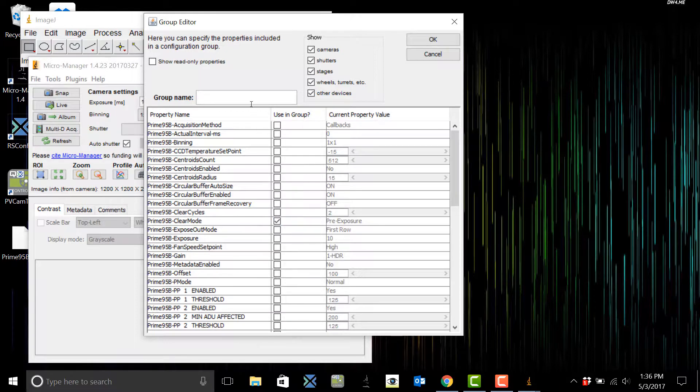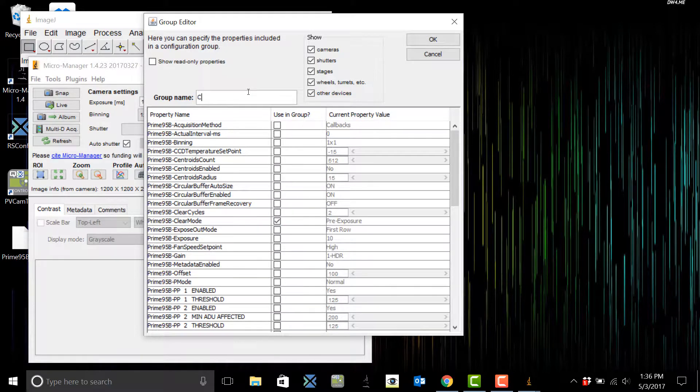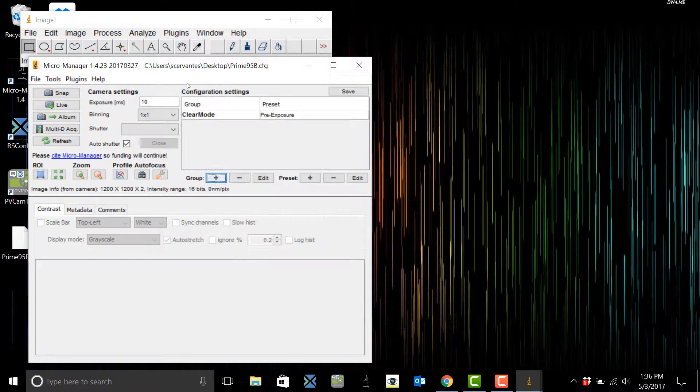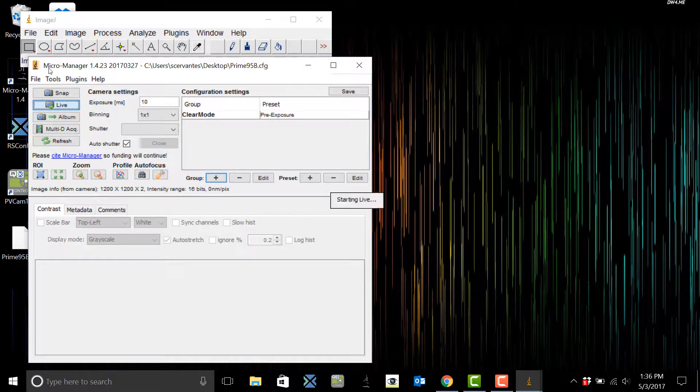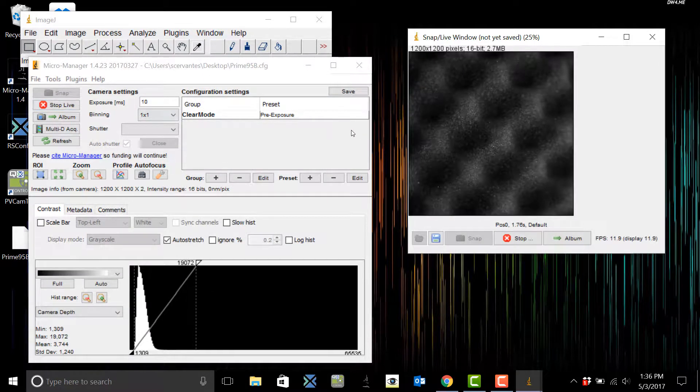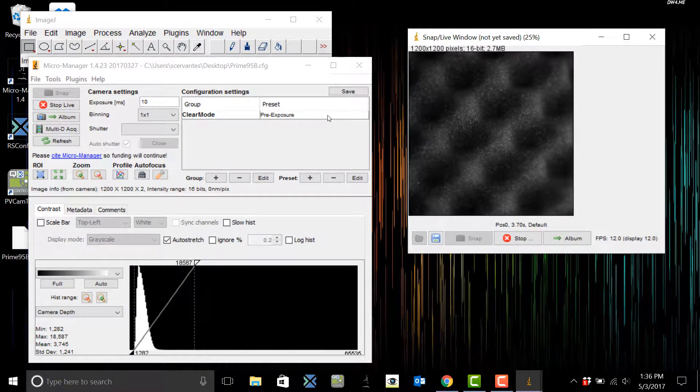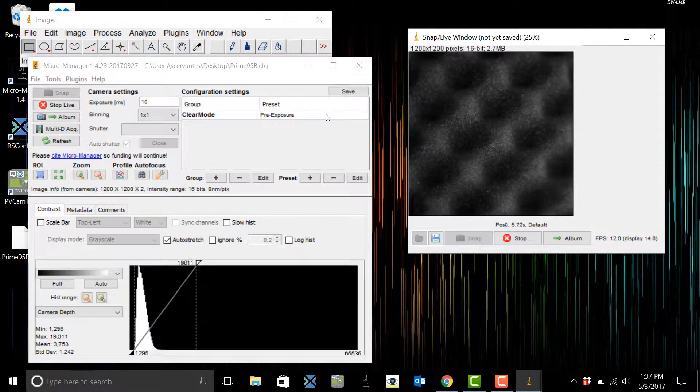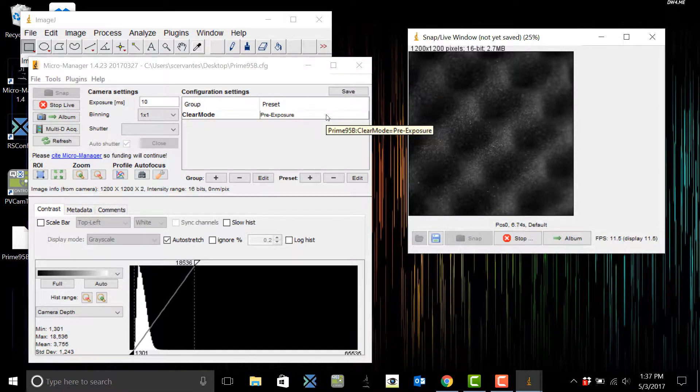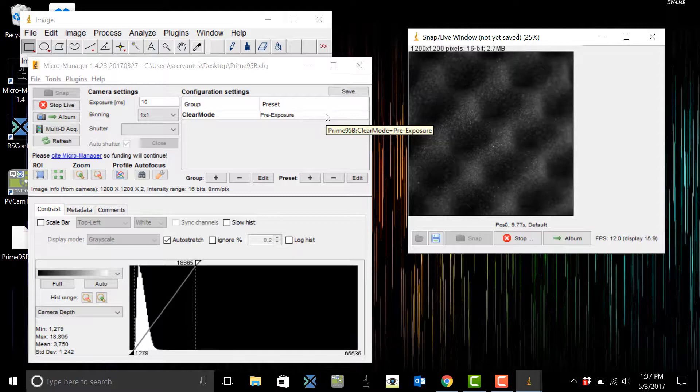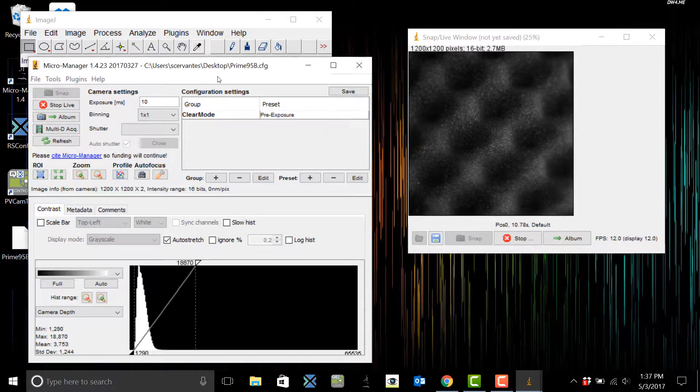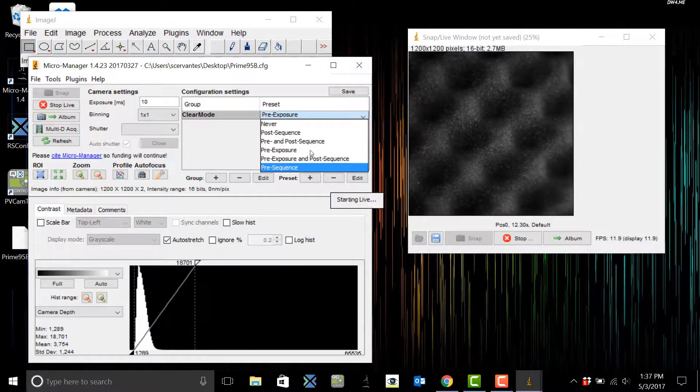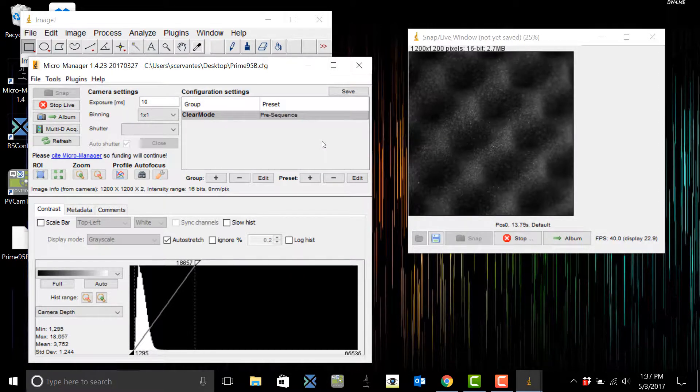Now if we go live, the default starts at pre-exposure and that means that the dark current is being cleared every single time an image is acquired. You can change this if you're making a movie to pre-sequence and this is going to clear the dark current at the beginning of the sequence.